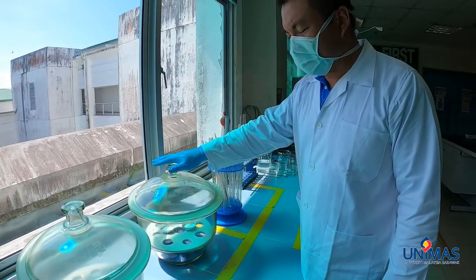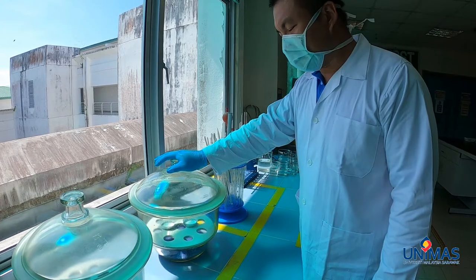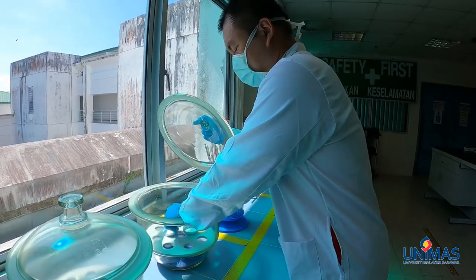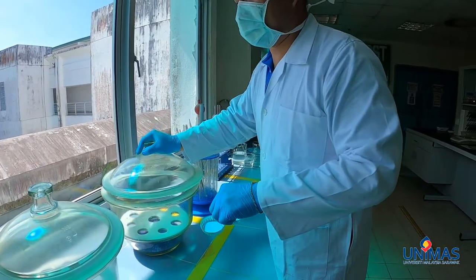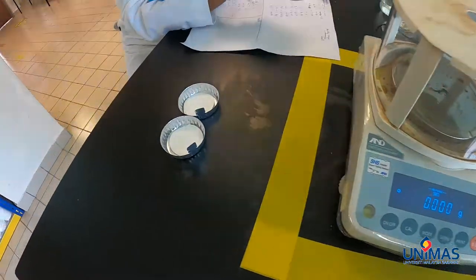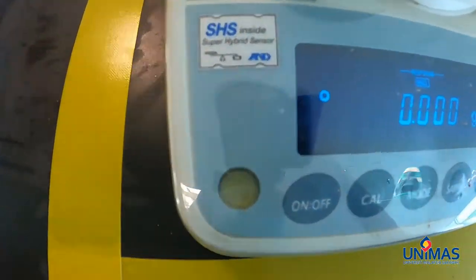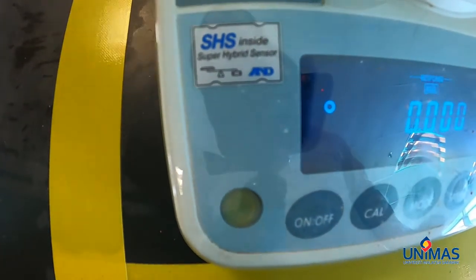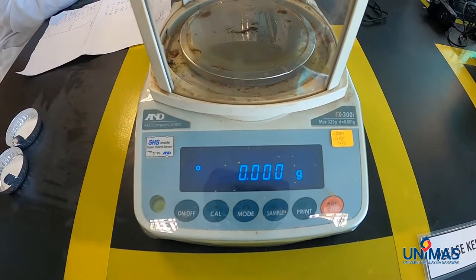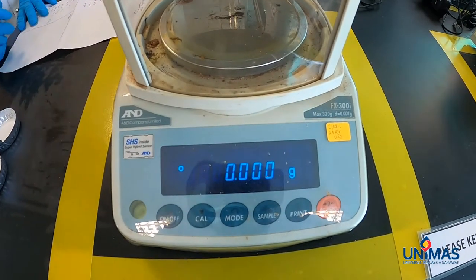We have already left the glass microfiber disc to cool down in the desiccator, so now we are going to take it out and measure the weight. We are going to measure the weight for each of the glass microfiber discs. Before using the balance, you need to make sure that the bubble is within the circle — as you can see here, it has been adjusted and everything is zeroed. Now we are going to put the glass microfiber disc onto the balance.